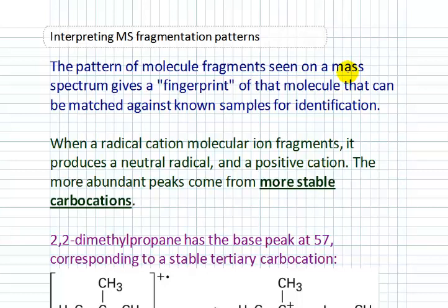One way that substances are identified that's very important in the forensic sciences, where a very small trace sample, for instance, is analyzed for its components. This is actually a common method that's used to detect propellants in arson investigations, for instance, or toxicology on blood samples to find very minute amounts of chemicals within the blood. Can use mass spectroscopy that way.